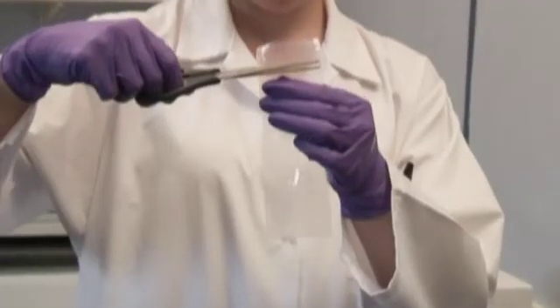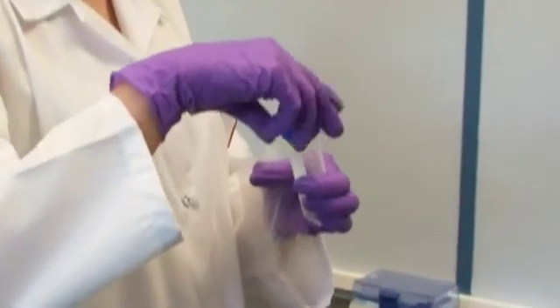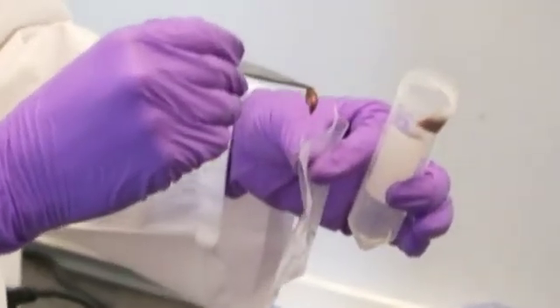The Stomacher 80 Biomaster with the new Microbag allows sample sizes from as little as 250 microlitres, ideal for small tissue samples such as mice spleen or lung.